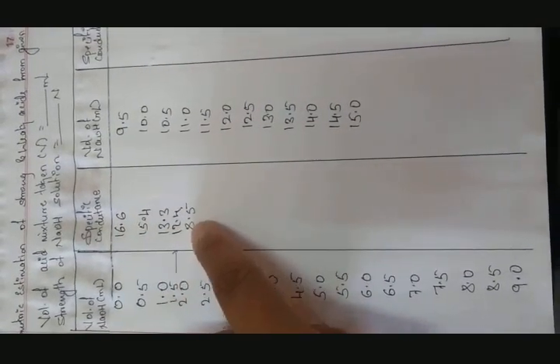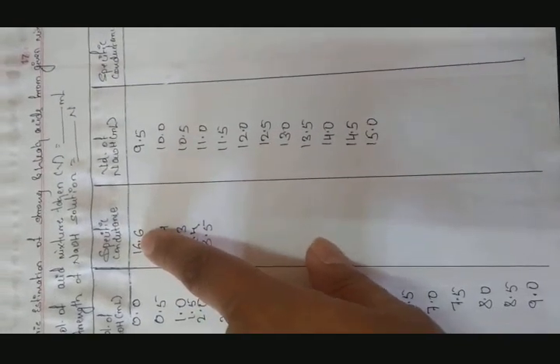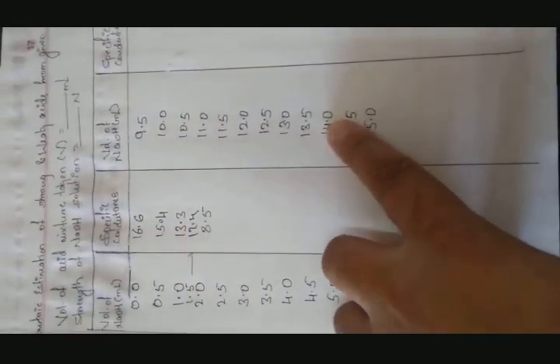So how long you have to do the addition of sodium hydroxide? The original value is 16.6. Conductivity decreases consistently, but it will increase after a certain addition of sodium hydroxide, till you get the original value 16.6. It comes at almost 13 to 14 cc. So up to that you have to add sodium hydroxide.